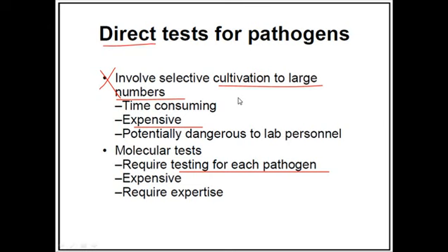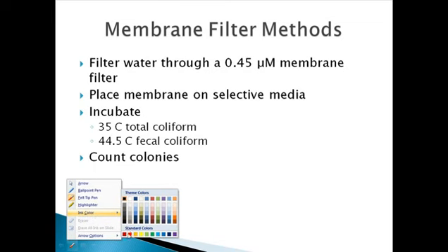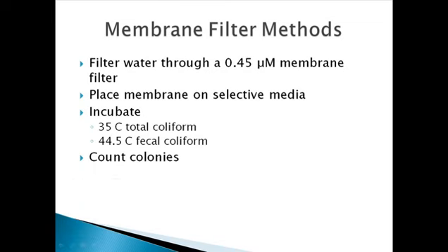What we are using nowadays are chemical techniques. So first, if we want to remove all those microorganisms from water, we can use filters. We can filter those microorganisms, and when you filter, you can find the microorganisms in the filters. They can be nylon filters, they can be diatomaceous earth filters. We have a funnel here.